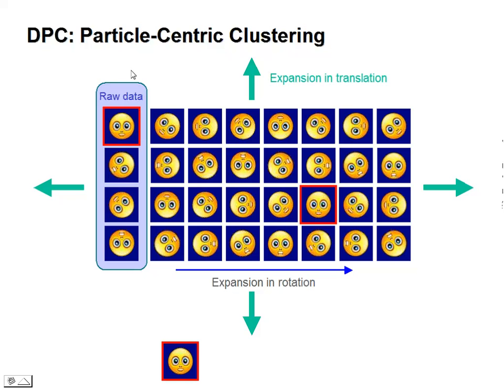In the eigenspace, we can identify the neighbors of this seed particle. For instance, a transformed version of particle number 3 agrees with the original particle number 1. And so on and so forth, we produce one class here.